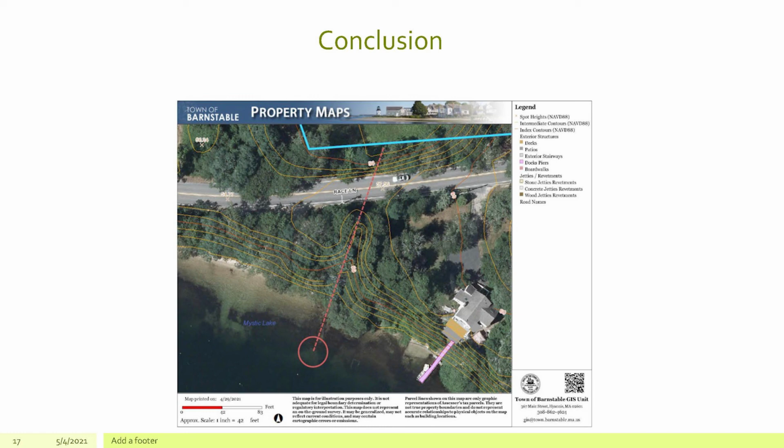In conclusion, the open lake water at Site A steadily remained clear, had a low odor, and held fewer sediments, where Site B was usually brown with a musty smell and held moderate sediments. Higher dissolved oxygen saturations were measured for the lake water at Site A and lower saturations for the stagnant water in the inlet at Site B.